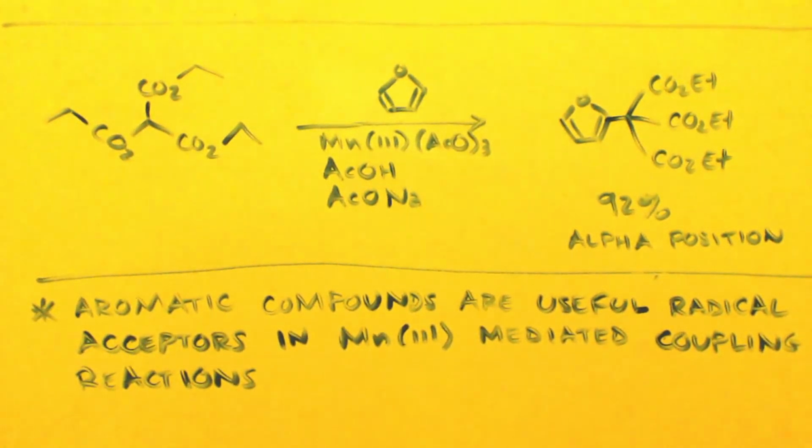You know what I mean? You would make it anhydrous. It's hard to get. And anhydrous acetic acid. You don't need it apparently because you can use the dihydrate. So I don't see the sense in making it that way. So this is a good thing. You can use the dihydrate. I just wanted to bring that up.